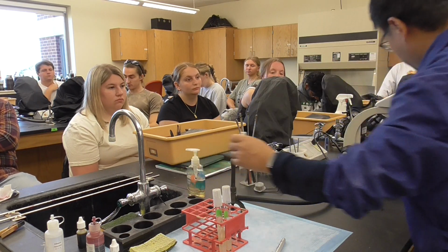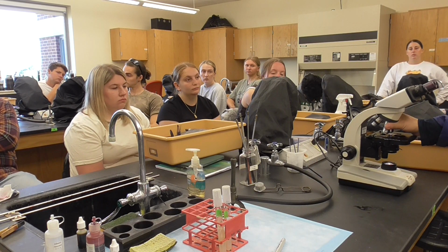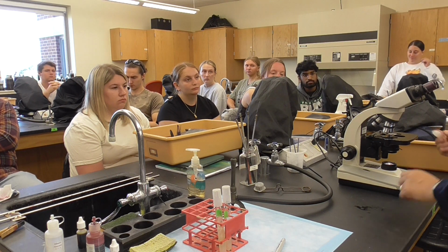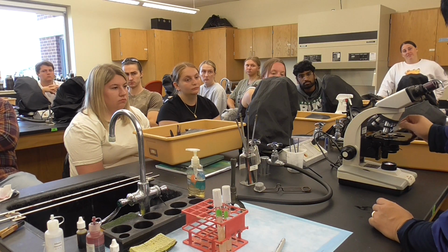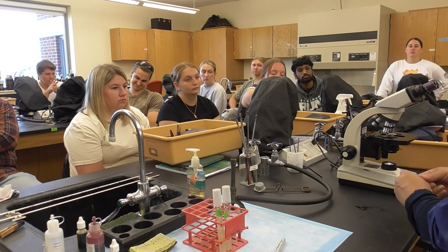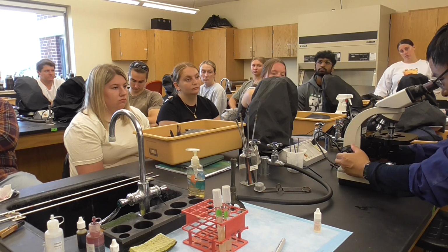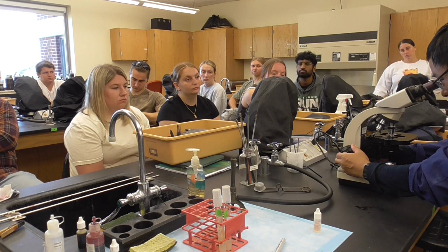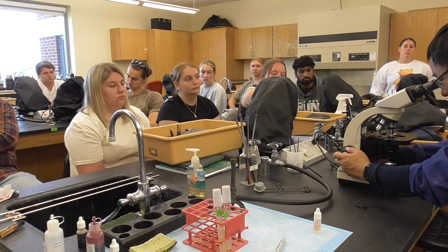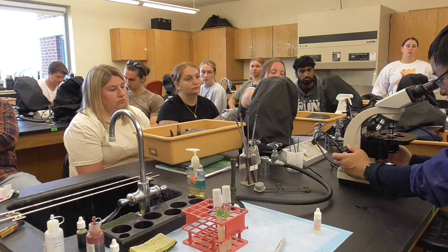So we're going to add oil. For oil immersion, we twist once, that's 40x, don't use it. One more twist. After Labor Day, you should still remember. Two more twists, and then we add a big drop of the oil. I'll just add oil there. Let's see what it looks like. Then we go here, and ideally only very minimal adjustment. Or what you find? Okay.